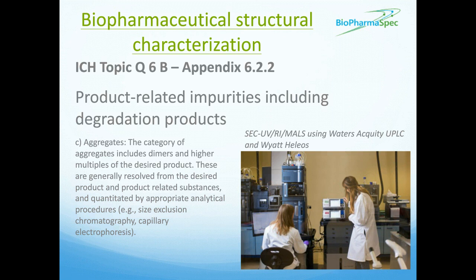Now, on the image on the right-hand side, you can see two of our scientists with our SEC-MALS system that we use routinely in biopharma spec.